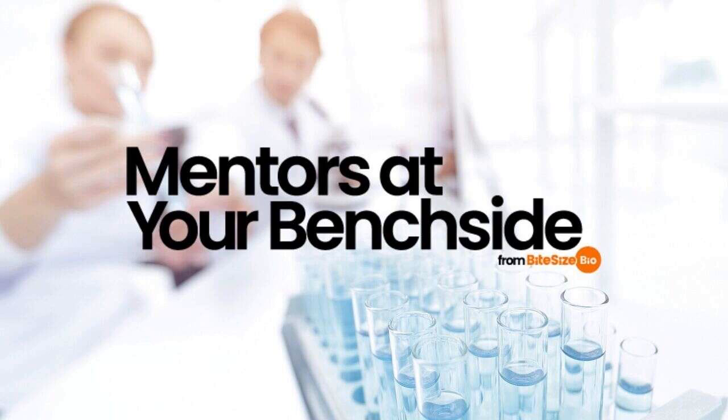Number 3. Photomultiplication. Any light that emerges from the CSLM's optical system may have a very low intensity, and so the photomultiplier tube, or PMT, is used to detect and amplify this light signal. Photomultipliers are capable of amplifying a faint signal around about 1 million times without introducing noise. The output from the PMT is an electrical signal with an amplitude that's proportional to the initial light intensity.